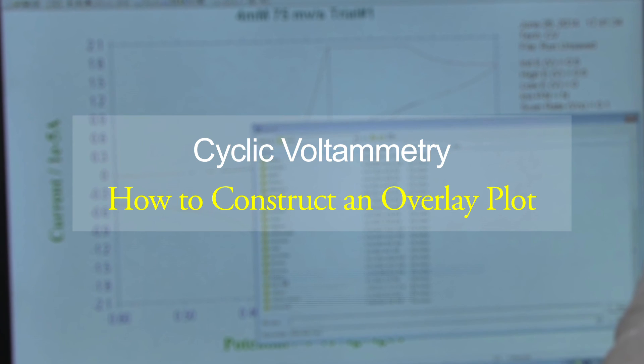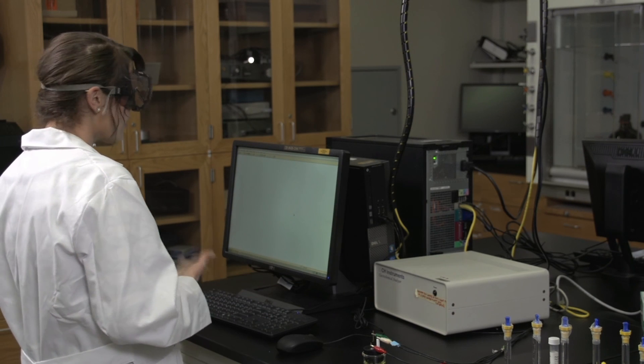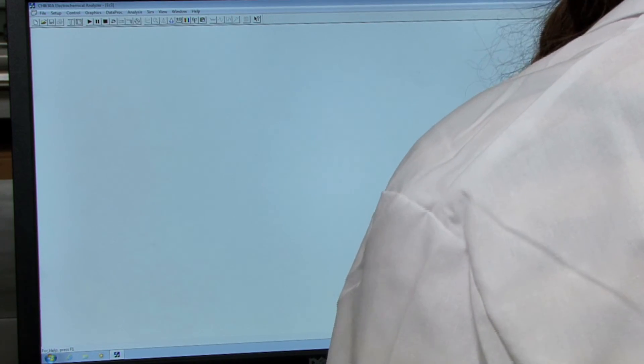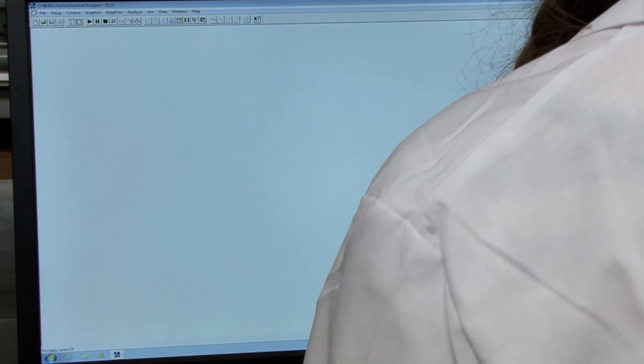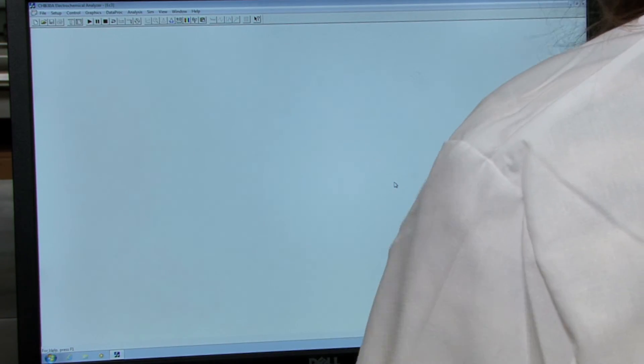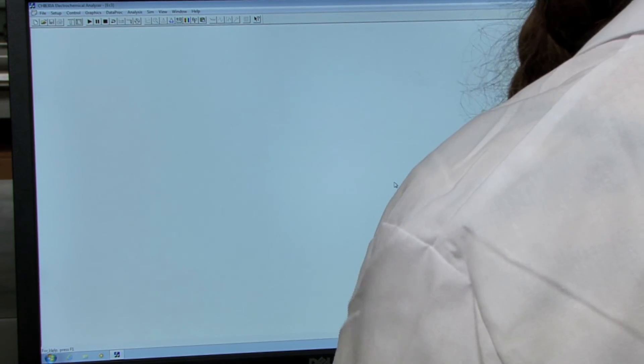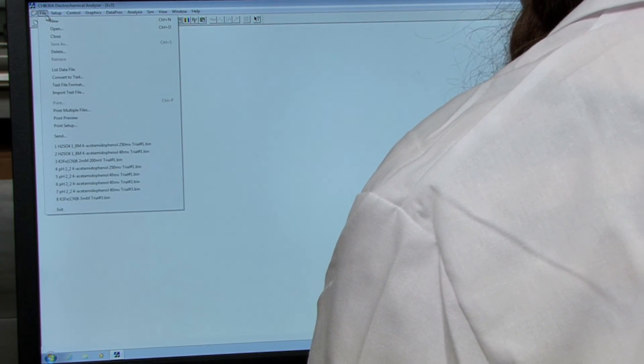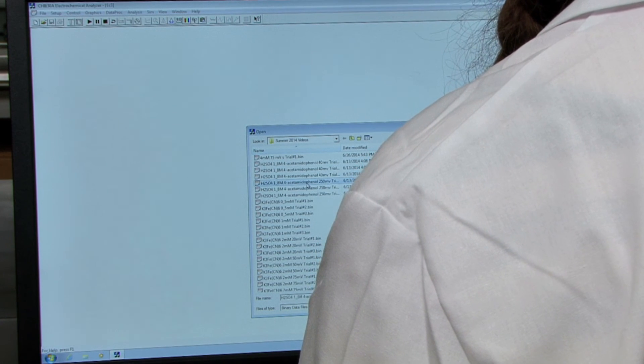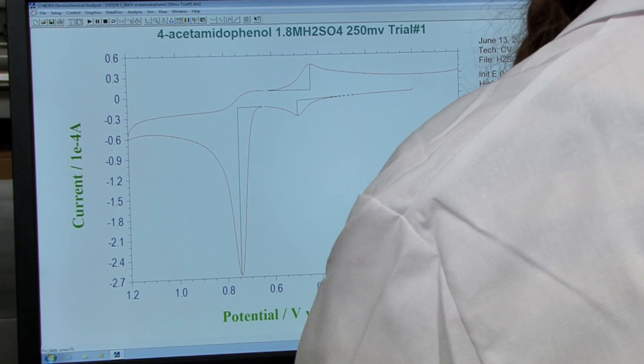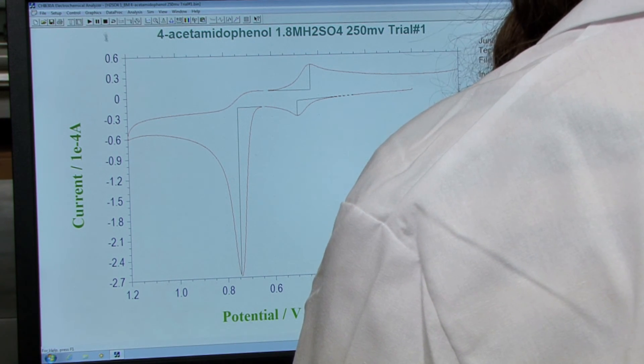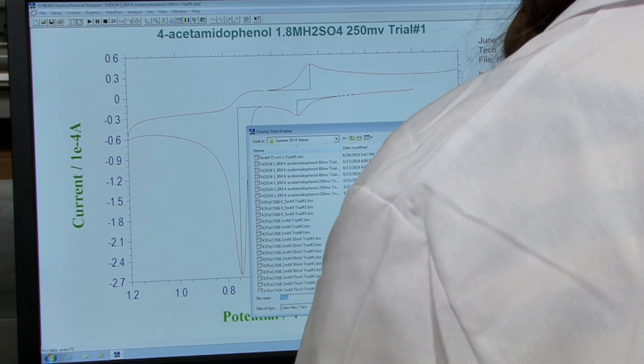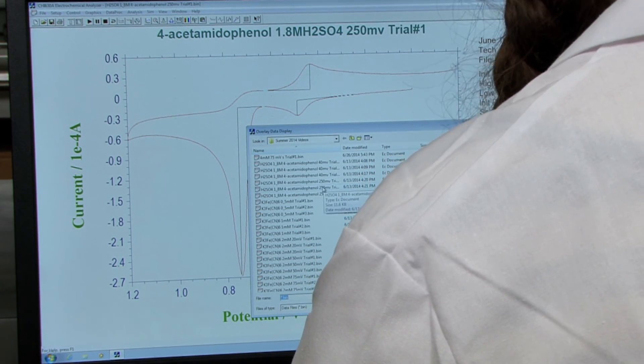Once you're finished collecting CVs of all your solutions, you need to make overlay plots. I recommend opening up a CV that has the widest y-axis, which corresponds to your current. Otherwise, when you try to overlay other graphs on top of that, it will cut off the top and bottom of your subsequent overlays. I'm going to first open a CV data results file. Now I'm going to make the overlay. To do that, go to graphics and then scroll down to overlay plots. Then select all the remaining graphs you'd like to overlay.